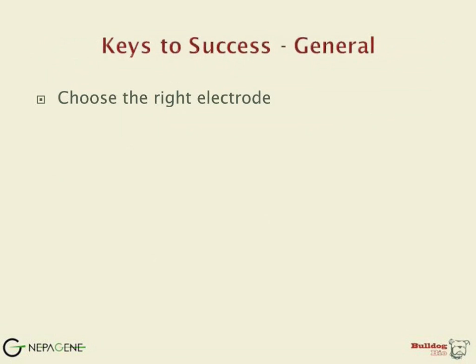A webinar is not a great platform for providing precise details for improving electrokinetic transfer experiments. Nevertheless, there are some simple rules that will go a long way to the successful delivery of DNA, RNA, or proteins into cells. First, choose the right electrode. This can sometimes feel daunting, but the literature is a big help in this case, along with the electrode company's expert advice. I'll go through some types of electrodes quite quickly to give you a feel for the breadth of this parameter.